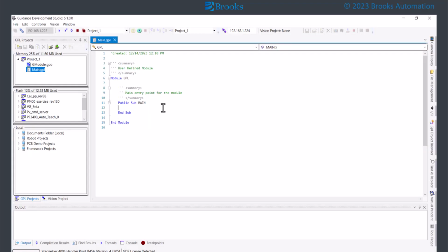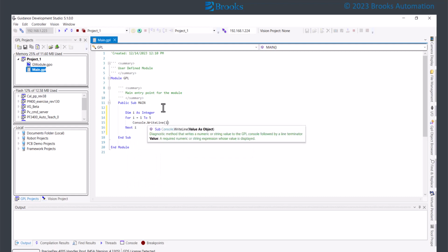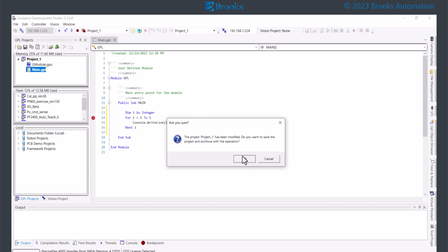The for control structure executes a sequence of instructions a fixed number of times. This control structure begins by setting the variable to the initial value. The variable can be any numeric type like a byte, integer, short, single, or double. Array variables as well as object and structure fields are also permitted. However, object and structure properties are not permitted.